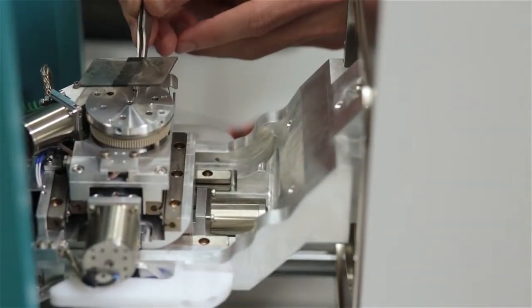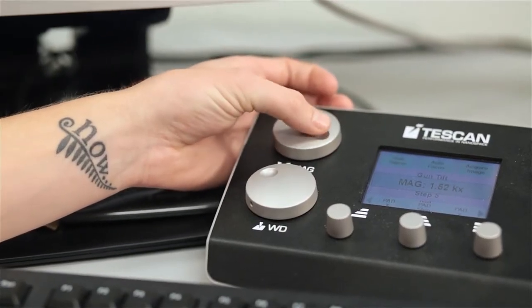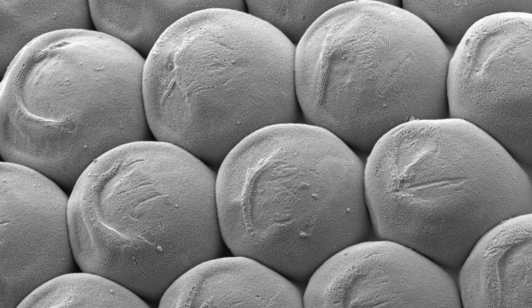So we've got optical microscopes upstairs, and you can look at samples at about 400 magnification on those, and this will get us several thousand magnification. So on those microscopes upstairs, we'll be able to look at maybe an individual grain that's about 1 millimeter across. On this, we're at the micron to nanometer scale, looking at some very, very fine detail of chemistry within these rocks. So we were taking a look at a very small insect that really you can't see much detail with the naked eye. You could see a little bit of detail with a basic microscope, but still this allowed us to zoom in really closely on the eye, for example, and see that it's made up of these very small compound structures.